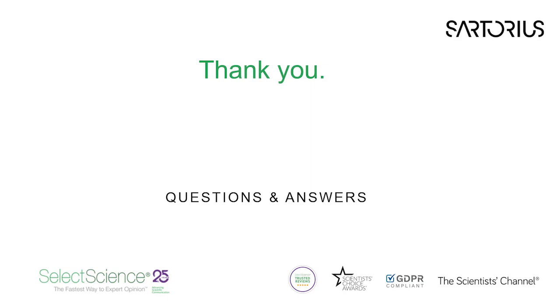Great, thanks for that. And what are the techniques for use with viscous liquid? Do you have any techniques you can use to pipette viscous liquids properly? Yeah, so viscous liquids are really, really difficult. If you are using an air displacement pipette, then my suggestion is that you do it very slowly. When you're aspirating, when you're lifting that plunger up, do it really slowly, as slowly as you possibly can, and that helps to prevent those air bubbles coming up. So that is my best suggestion for viscous liquids. If you've got a really, really viscous liquid, say for example, something as thick as honey, then you may be better using a positive displacement pipette.